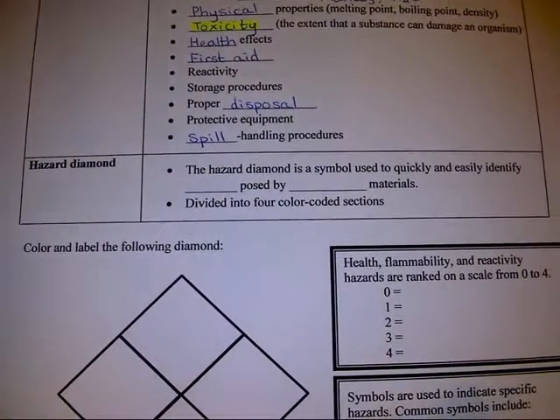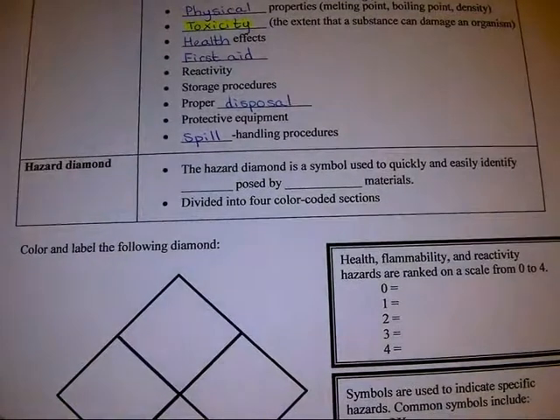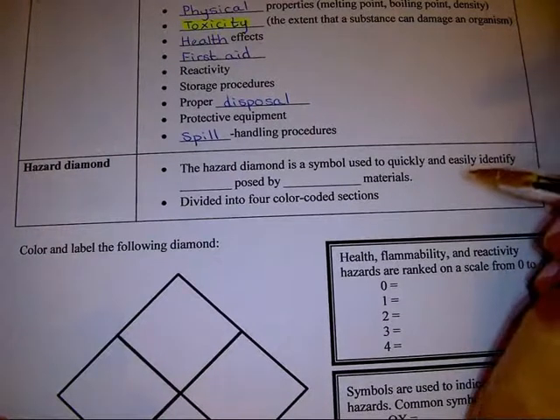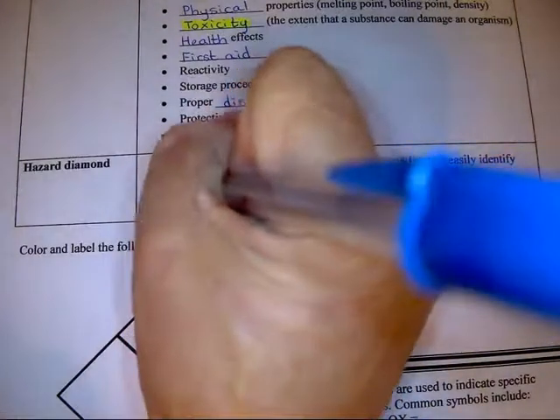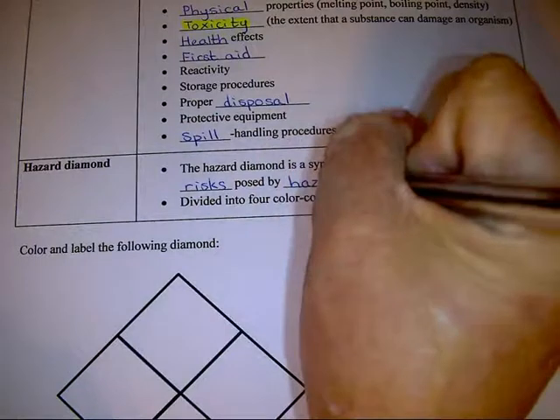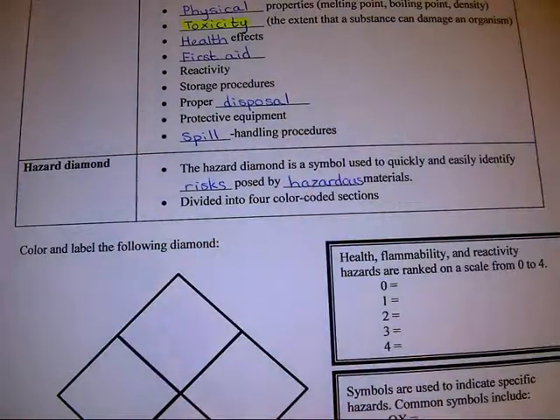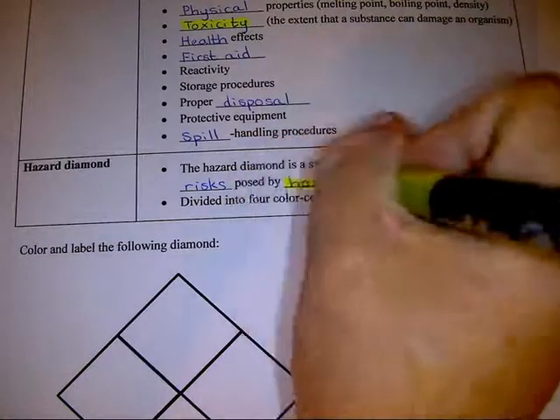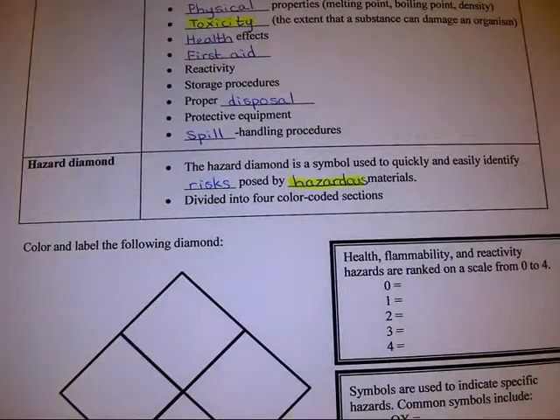Along with an MSDS, a hazard diamond can be very informative to us about a chemical. The hazard diamond is a symbol that is used to quickly and easily identify risks posed by hazardous materials. I'm going to highlight the word hazardous. Hazardous just means dangerous.